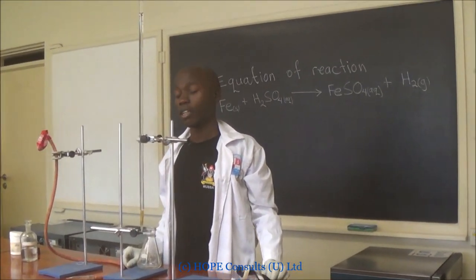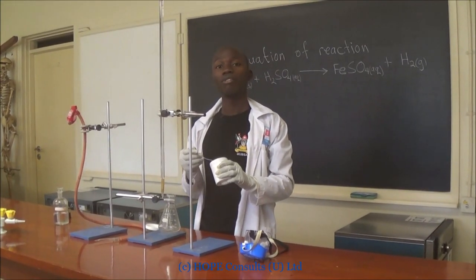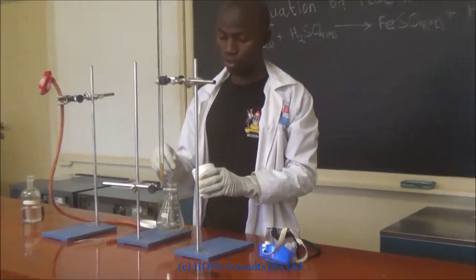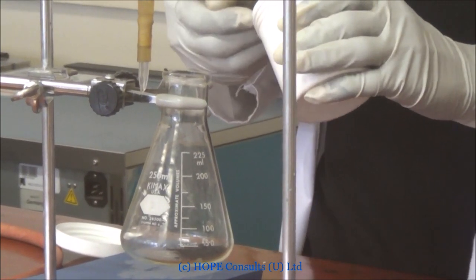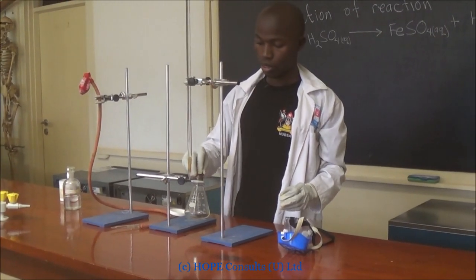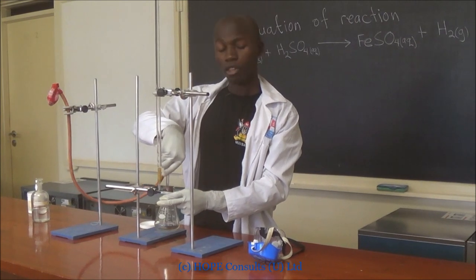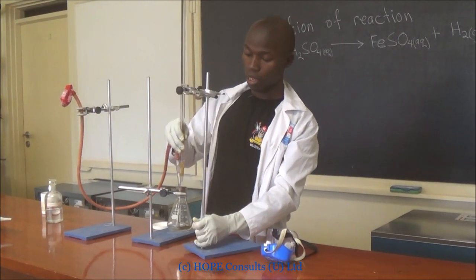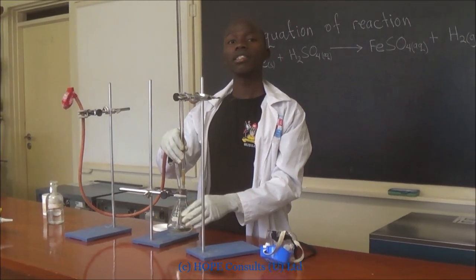Now I set up the apparatus as you look on. I add 4 spatula-fuls of iron into the conical flask. After that, I put the cork and insert the rubber tube that will collect the gas. And then I also insert the burette which contains the sulfuric acid.